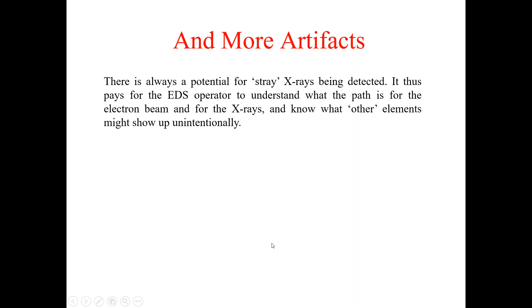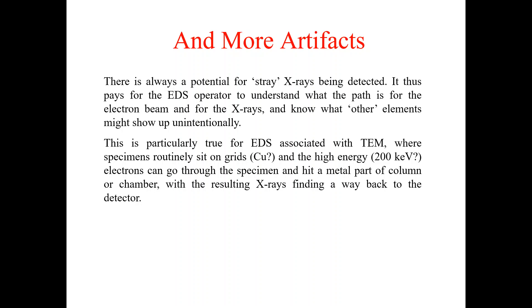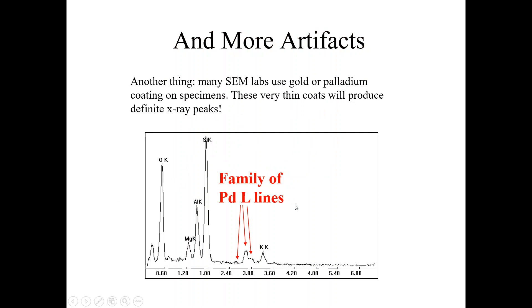More artifacts: there is always potential for stray X-rays being detected. It pays for the EDS operator to understand the path for the electron beam and X-rays and know what other elements might show up unintentionally. This is particularly true for EDX associated with the TEM, where specimens are routinely set on a copper grid. In TEM the energy is very high — approximately 200 keV — so electrons can pass through the specimen and strike a metal part of the column or chamber, with resulting X-rays finding their way back to the detector.